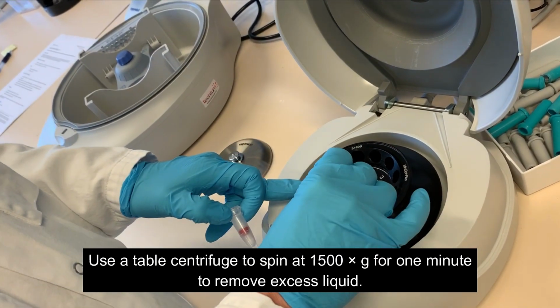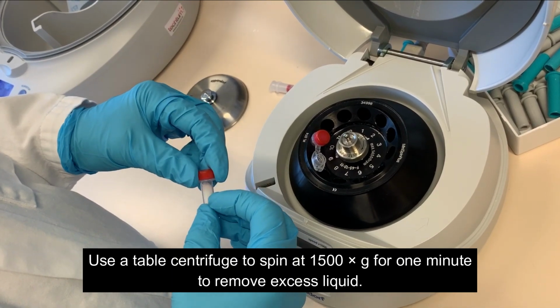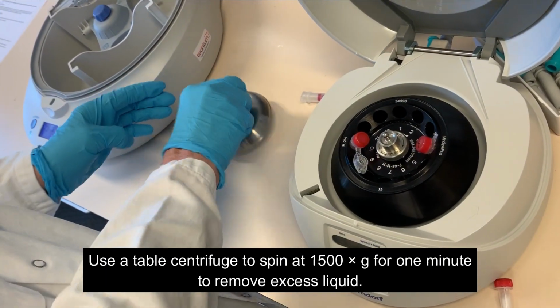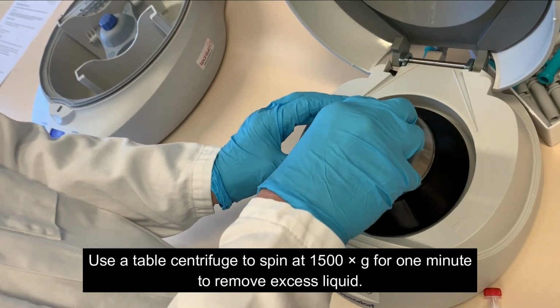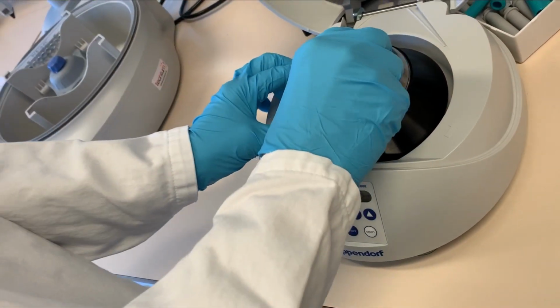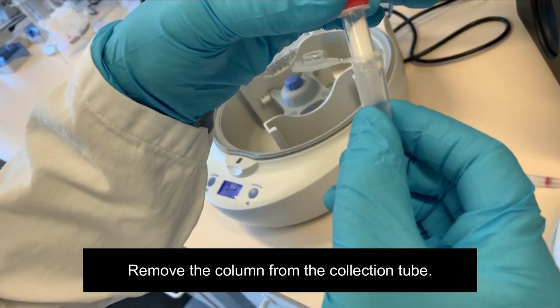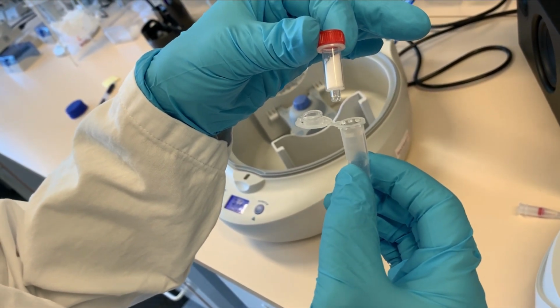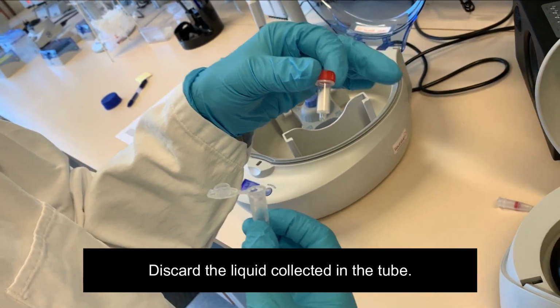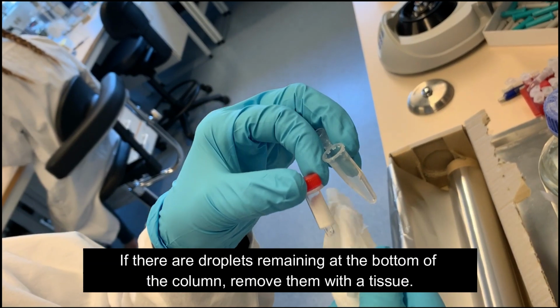Use a table centrifuge to spin the mixture at 1500 G for 1 minute in order to remove excess liquid. Remove the column from the collection tube once the centrifugation has finished. Discard the liquid collected in the tube. If there are droplets remaining at the bottom of the column, remove them with a tissue.